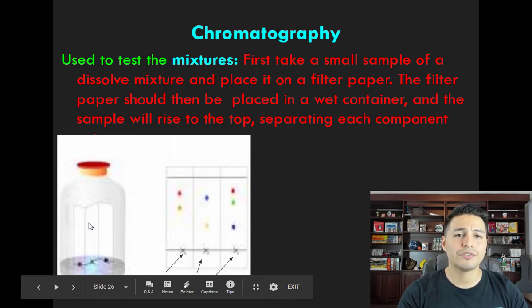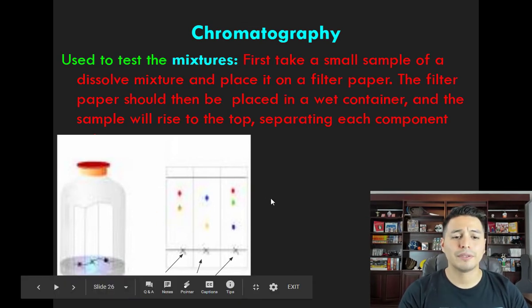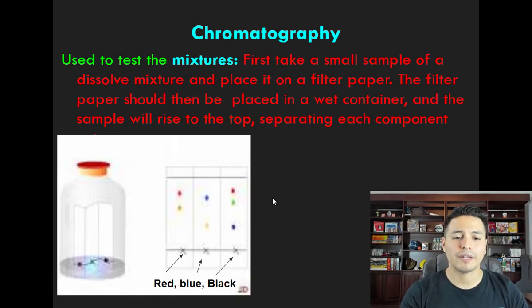As you can see, once you've taken it out over here, we move on to 2 parts of red. Red is simply 2 parts, 1 part red, 1 part yellow. Blue is simply 2 parts as well. It's 1 part blue and 1 part, it looks like it's yellow. Next we have black. Black is 3 parts. It's 1 part red, 1 part green, and 1 part purple.